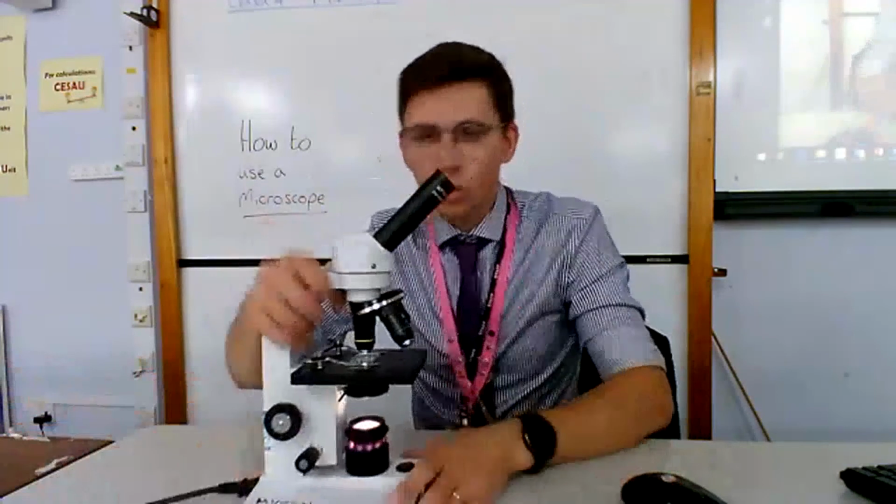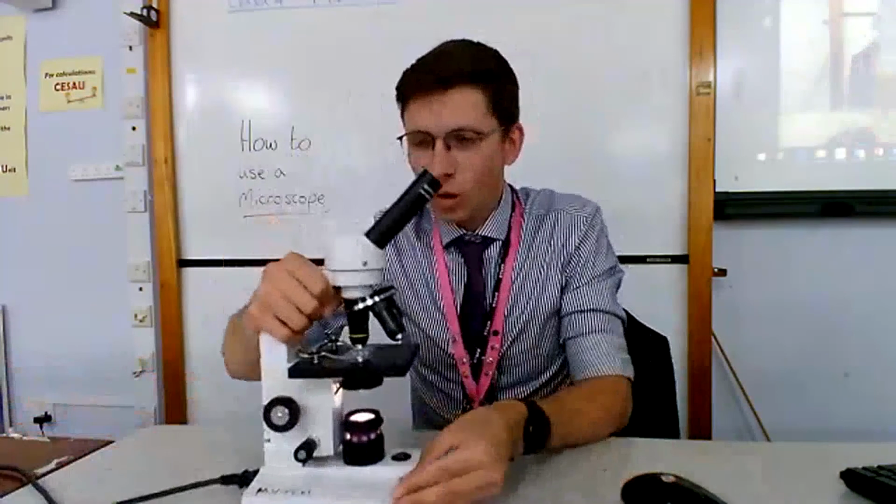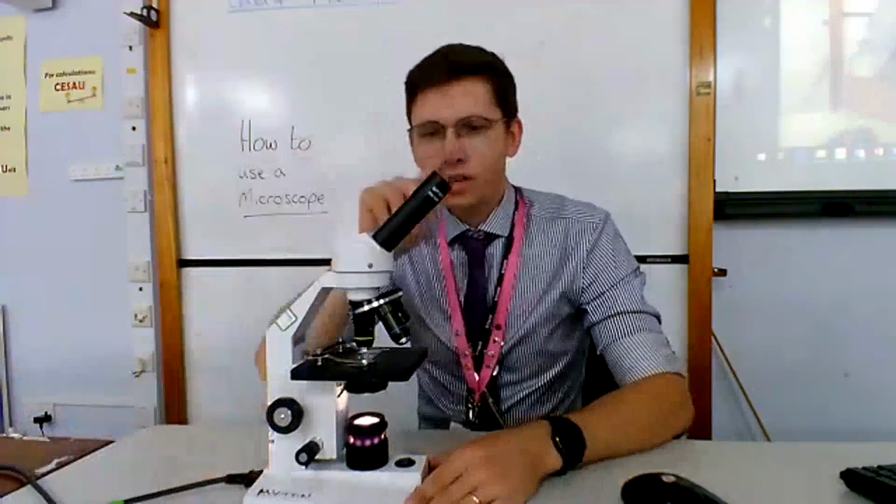Hopefully, we know how to walk with it safely. We know what all of the different parts of the microscope are and what they're used for. And we know the step-by-step method on how to see a specimen under the microscope.